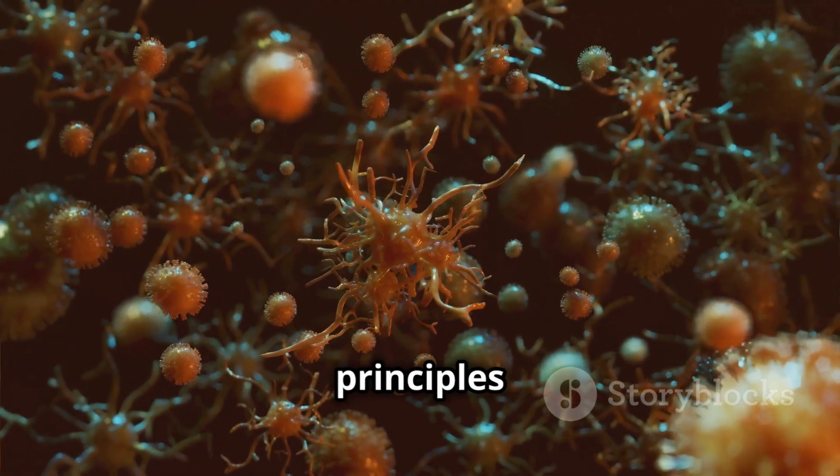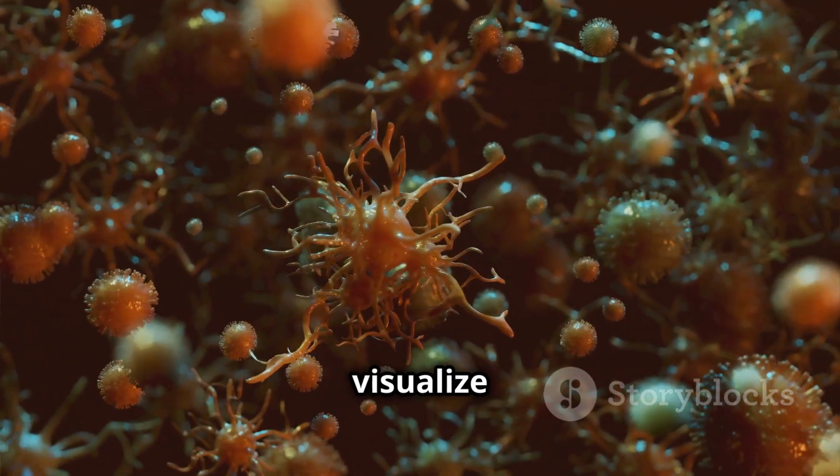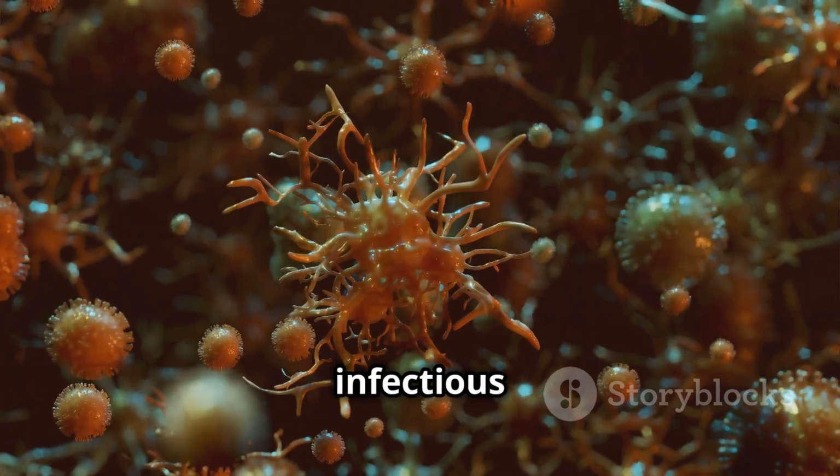By understanding the principles of staining techniques, microbiologists can effectively visualize and identify bacteria, leading to better diagnosis and treatment of infectious diseases.